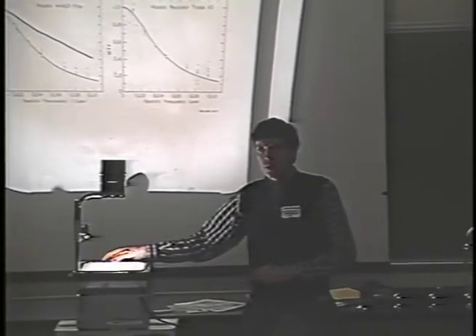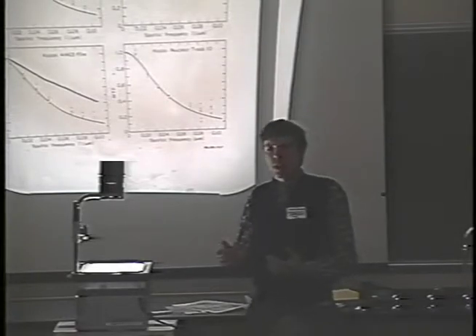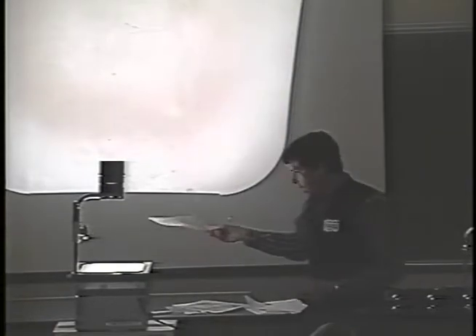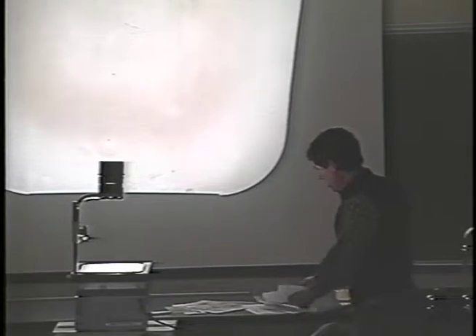There are some practical problems with some microscopes: the microscope itself, probably because it's sensitive to magnetic field disturbance, does not perform well at low magnification. And I asked Mike Krisker of JEOL if he could, on a trip to Japan last year, take some images of gold film at 400 kV at about 50,000 magnification. And he did that for me, and he sent some images back.